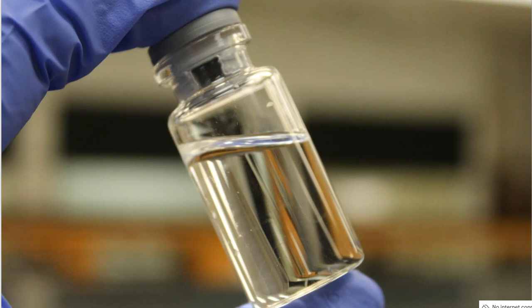However, we just can't use one test in order for us to determine what the compound is. We need proof. We need evidence. And it's often going to require more than just one type of test. And that's the purpose of this experiment.